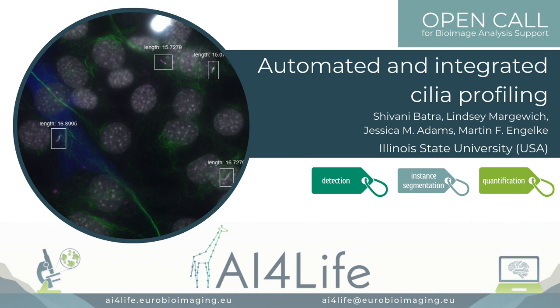And this was particularly challenging because this may not always be the closest nucleus in the case of, for example, very elongated cells. Once we'd done that association, we needed to measure the corresponding cilium length and the motor protein expression in a perinuclear region.